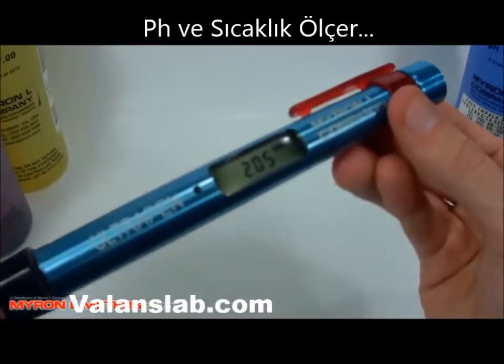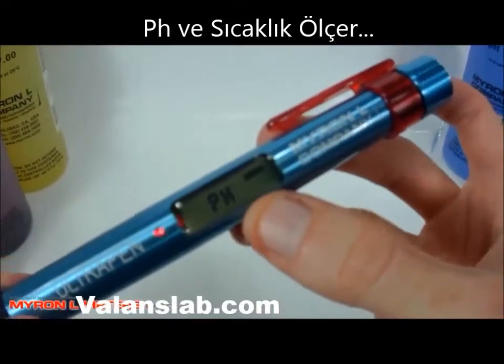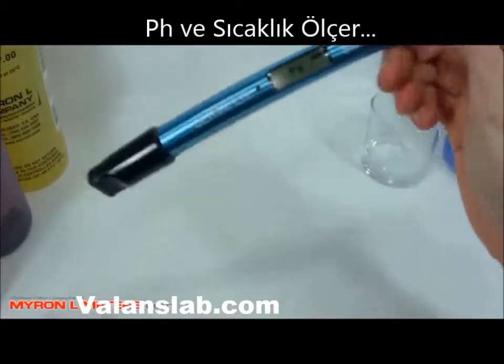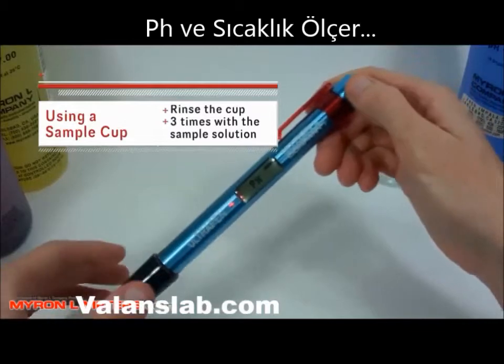When you press it, the firmware version is shown and then it immediately starts to take a measurement. The red blinking light means you put it in the solution, swirl it around and knock any air bubbles loose.